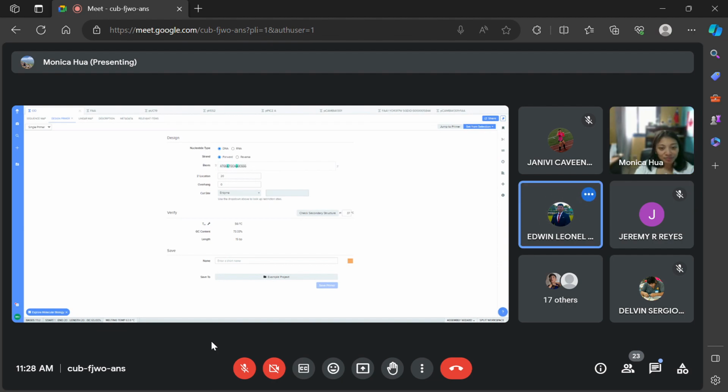So you could have a good cutting sequence, but still this doesn't work out properly. You're not going to get what you need, or you have to start all over. Yes. Okay, good question.